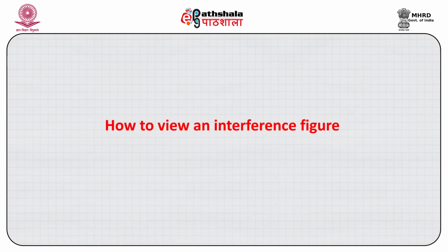So, how do we obtain an interference figure? For this, we observe a thin section under the microscope, choose a grain and observe it under the maximum objective lens available in the microscope. After that, we insert the auxiliary condensing lens, open up the iris diaphragm and refocus the mineral all over again.